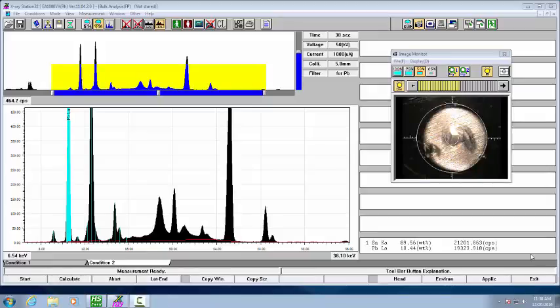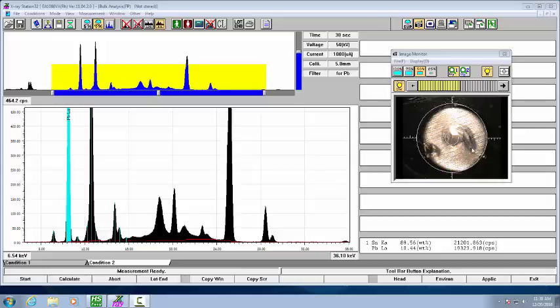I'm working on the Hitachi EA 1000 VX with Vortex silicon drift detector. I currently have a solder sample in the chamber.